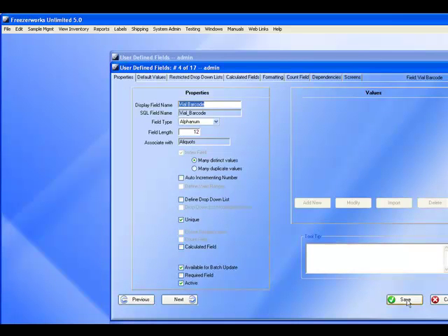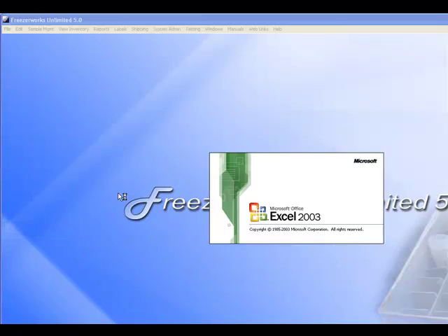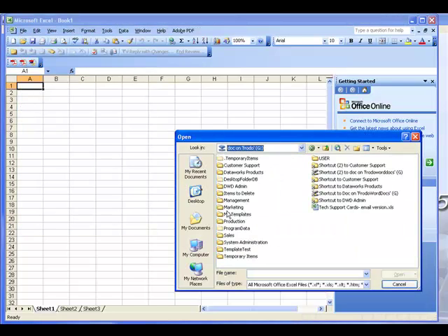Okay. The other thing you need to do is you need to have Thermo Visionmate import when it reads the tube. Let me give you an example. What you need to do is when it reads the tube, it needs to, let me go find my tubes here.